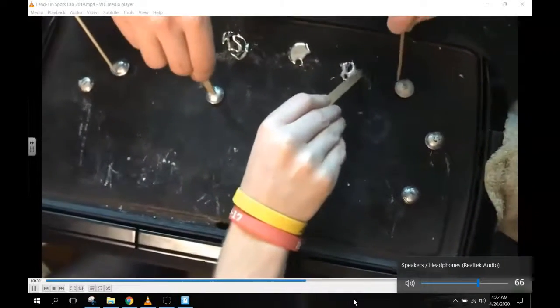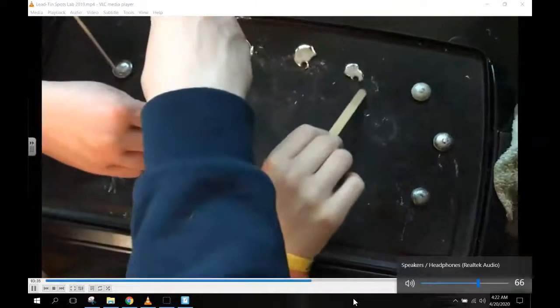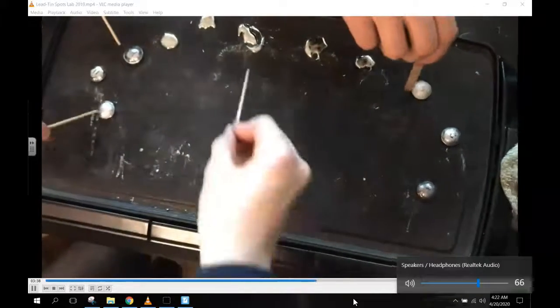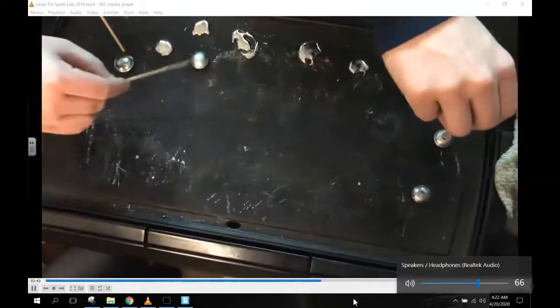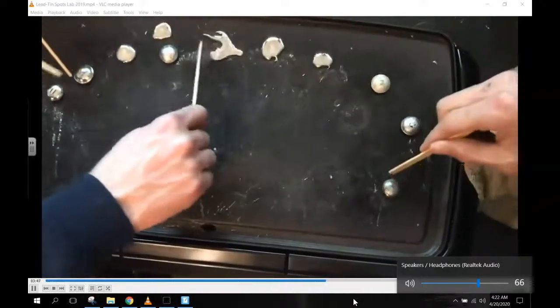Dude, it's a bubble. Now this guy's not gonna melt because he's not on the heating element. What is this one? That one's mine. That's 7. I moved it out because they were getting in the way. I didn't want it to get mixed up with the other ones. So 7 hasn't gone yet. Somebody poke 11.